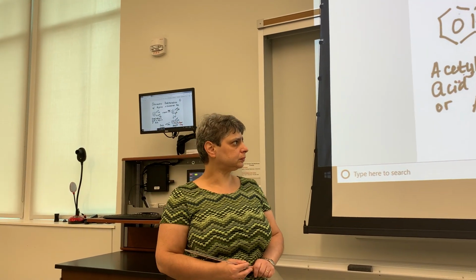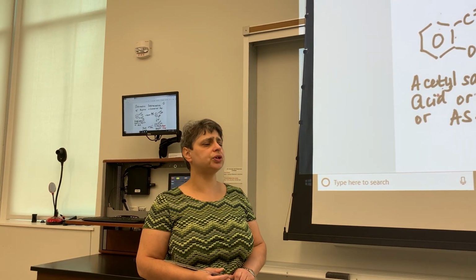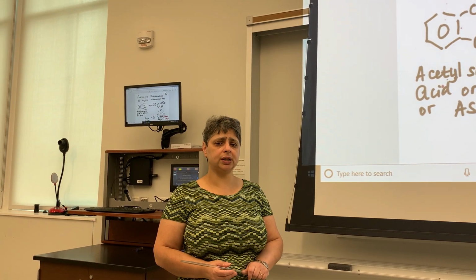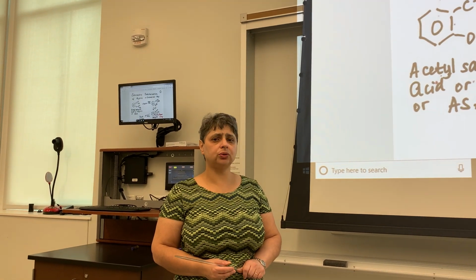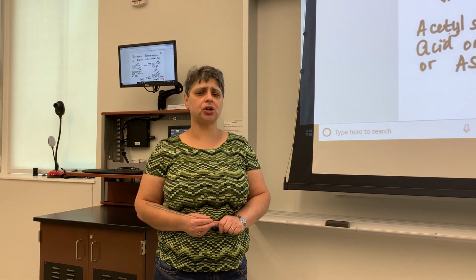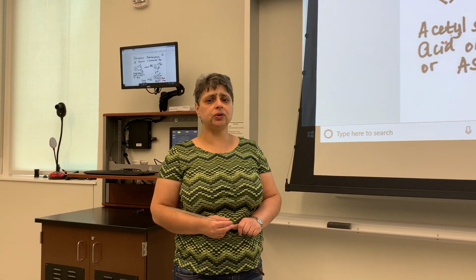So we're once again looking at aspirin, and at this time the general goal of this experiment is to quantitatively determine aspirin content in various commercial preparations. These days in the supermarket or pharmacy, we can find a variety of medicines available over the counter that contain a mixture of several pain-relieving ingredients, and aspirin is often one of them.